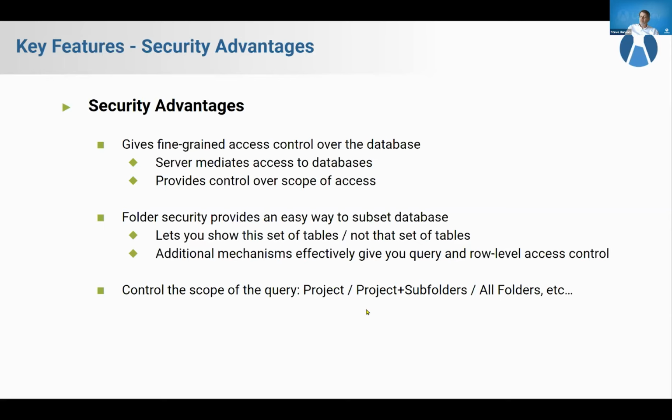And also another great advantage that the folder framework gives you is control over the scope of a query. Oftentimes, data containers in LabKey, like say a list or an assay design, can actually span multiple folders in LabKey. Like for example, an assay design, you can define it up at the project level at a top level folder, but then that design, that shape, is available in all of the subfolders. The data itself can be sprinkled throughout that folder structure. Could be some up in the project, could be some in this subfolder, some in this other subfolder.